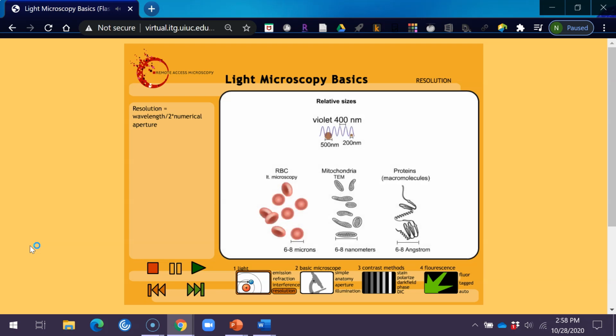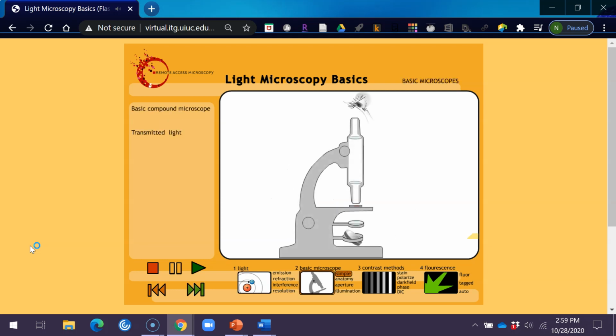The theoretical resolution limit of a far-field optical microscope is approximately half the wavelength of its light when using an objective with a numerical aperture of 1. The discovery of the law of refraction in 1621 made possible the development of the compound microscope. The basic compound microscope consisted of two convex lenses in series, an objective lens close to the specimen, and an eyepiece lens near the observer's eye.